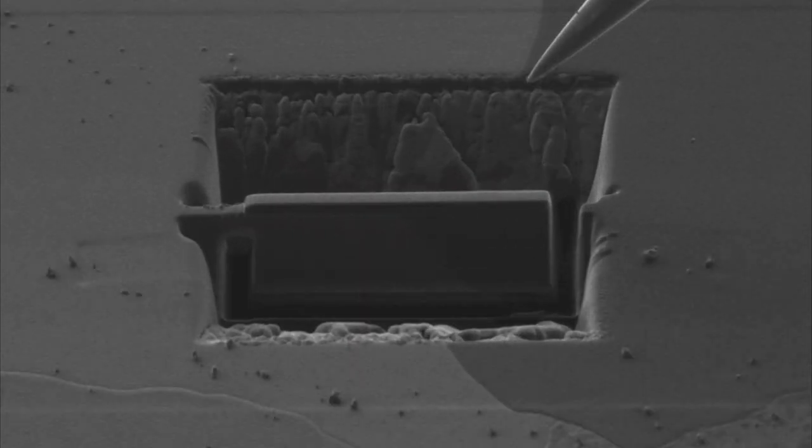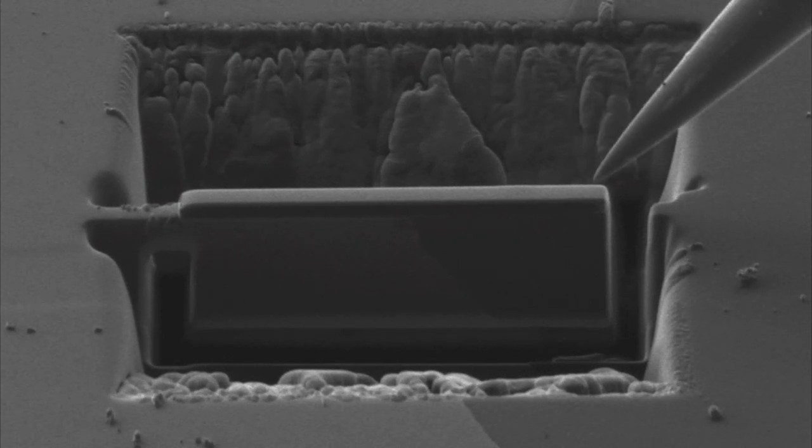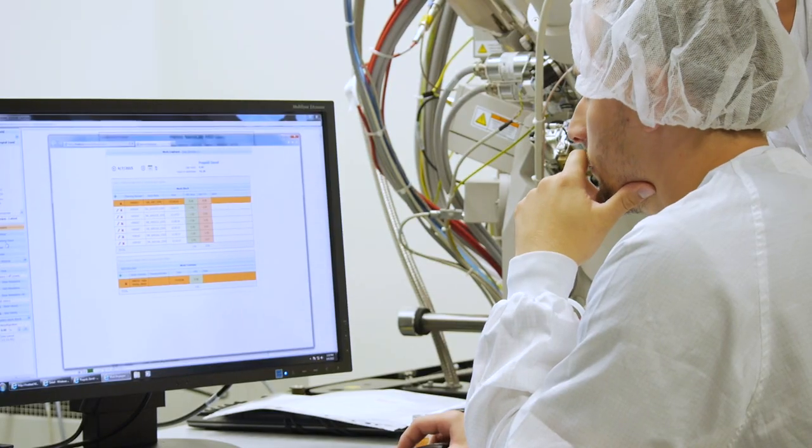This is an application testing for the preparation of lamella for further observation in a transmission microscope. Its thickness and overall quality is being tested. The testing program again helps with the evaluation.